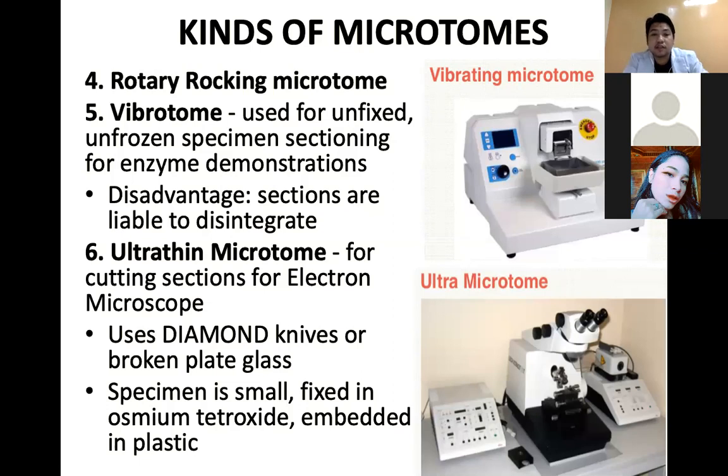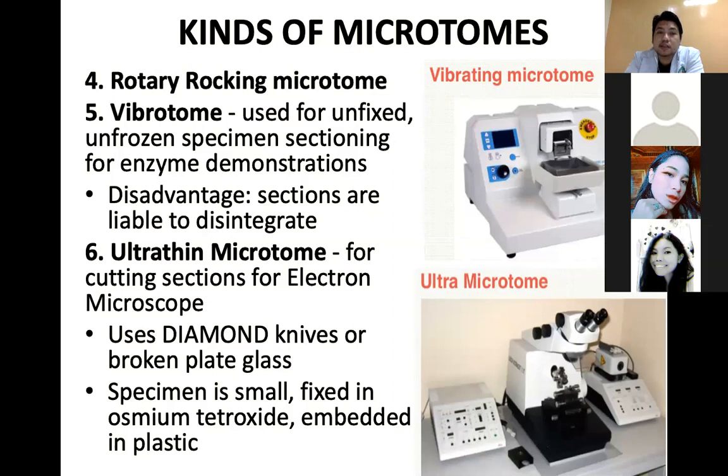The disadvantage of using this type of microtome is that it is liable to disintegrate our tissue, since those tissues are unfixed and unfrozen, so they disintegrate easily. And then the ultra thin microtome. This microtome is specifically made for our electron microscopy.